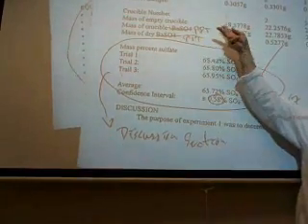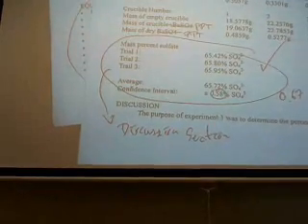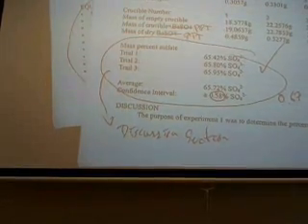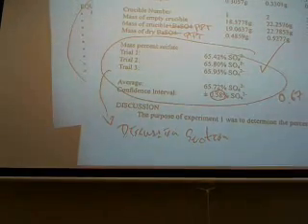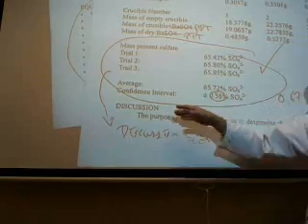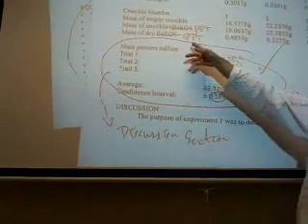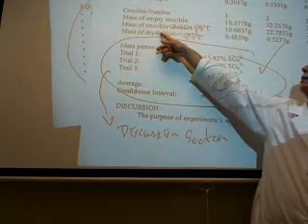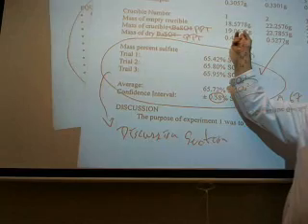What's the difference between results and discussion? I'll tell you. The results section is just the facts of the experiment. The discussion section is your interpretation of the facts. Here, this wasn't good, so I had to cross this out. Mass of crucible plus precipitate is 19.0637.